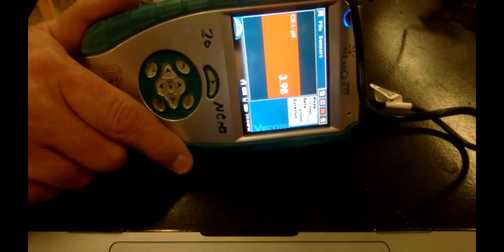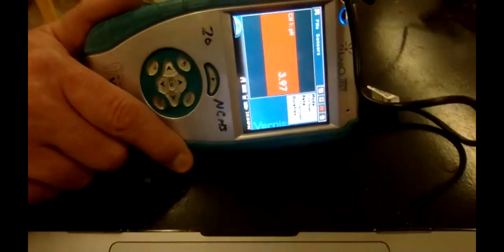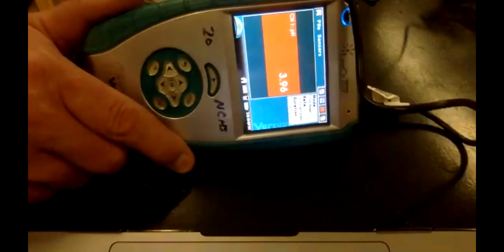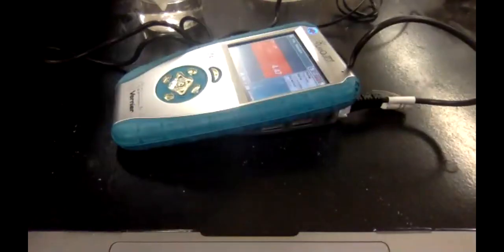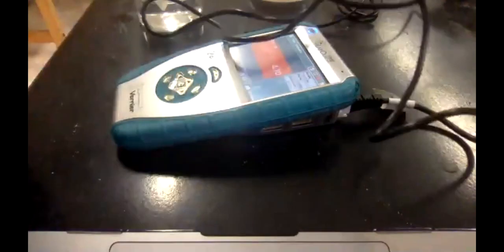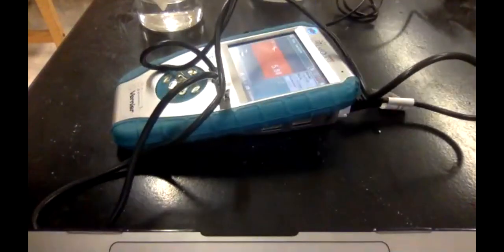You can see that these are a little bit better than the ones before, because those of you at home, those bounced around a lot. So these are a little bit better. Notice every time I'm rinsing it off with distilled water, you can also do that like this, using the distilled water bottle.